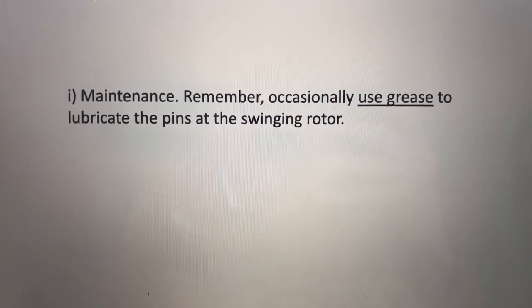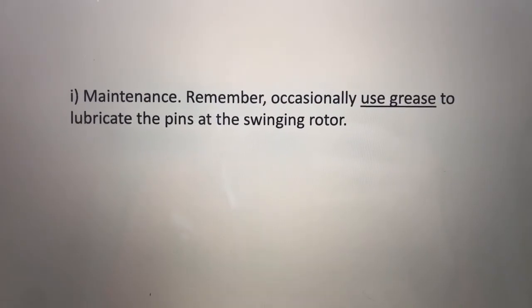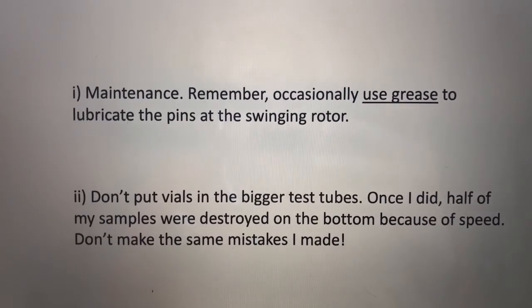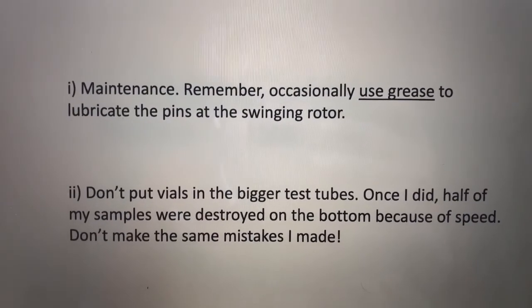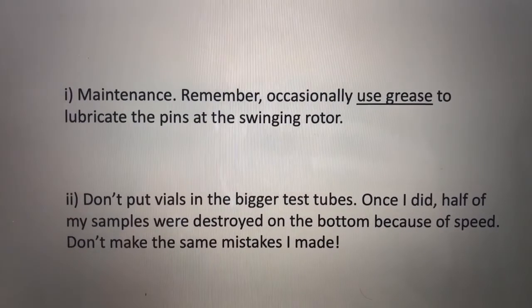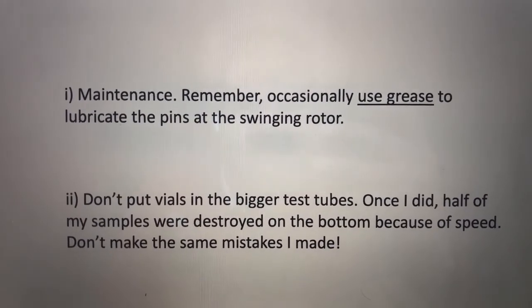Okay, in the end just a few tips and tricks. First of all, maintenance. Remember, occasionally use grease to lubricate the pins at the swinging rotor. Damn, don't put vials in the bigger test tubes. Once I did, half of my samples were destroyed on the bottom because of speed. Don't make the same mistakes.